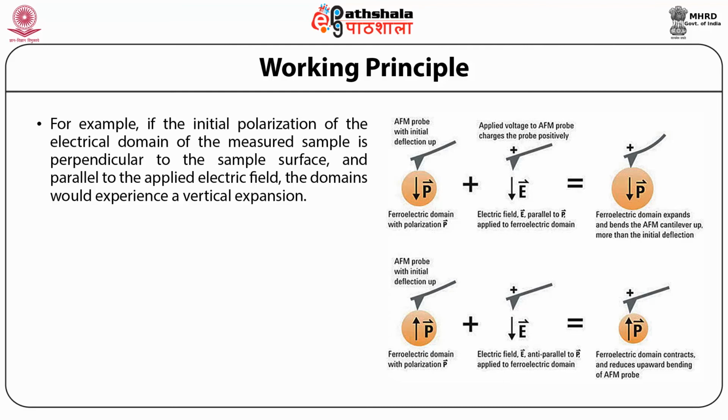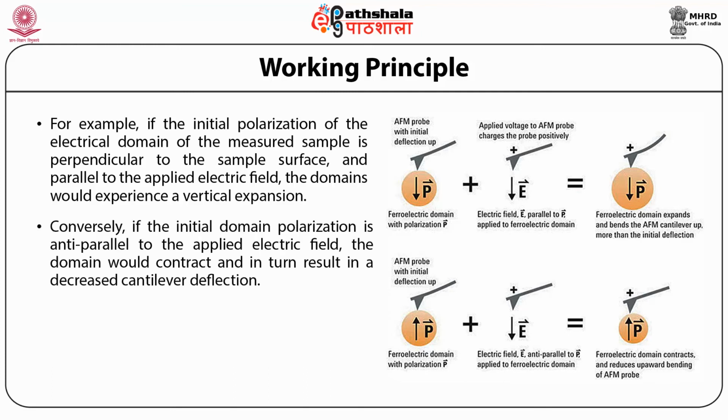Since the AFM tip is in contact with the sample surface, such domain expansion would bend the AFM cantilever upwards and result in an increased deflection compared to the status before applying the electric field. Conversely, if the initial domain polarization is anti-parallel to the applied electric field, the domain would contract and in return result in a decreased cantilever deflection, as shown in this figure.